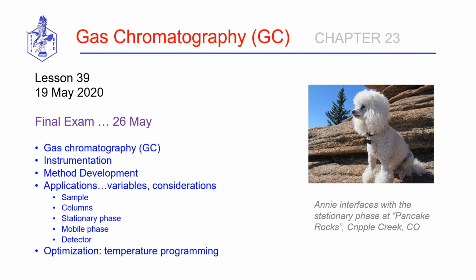So obviously, that analysis tool is the preferred method that stands up in legal courts as the positive identification of restricted substances, etc. So very important technique.